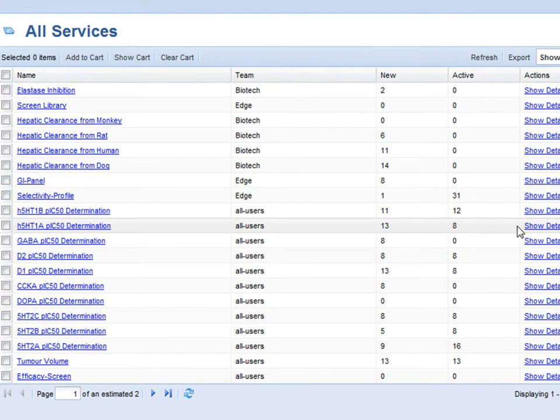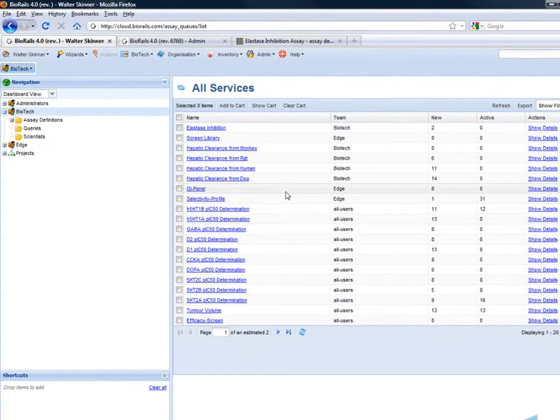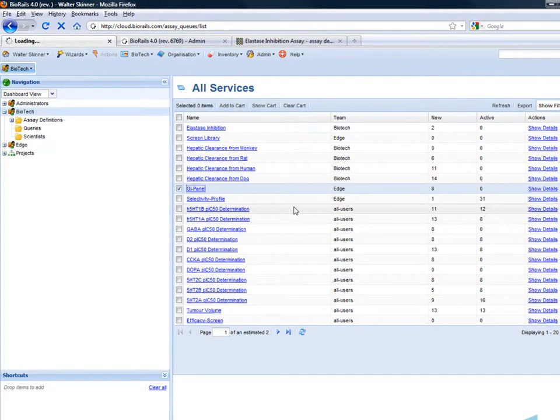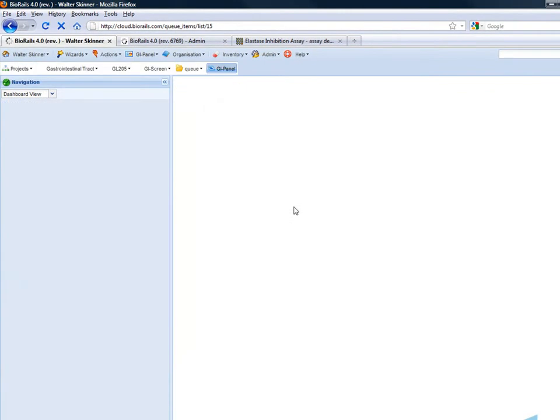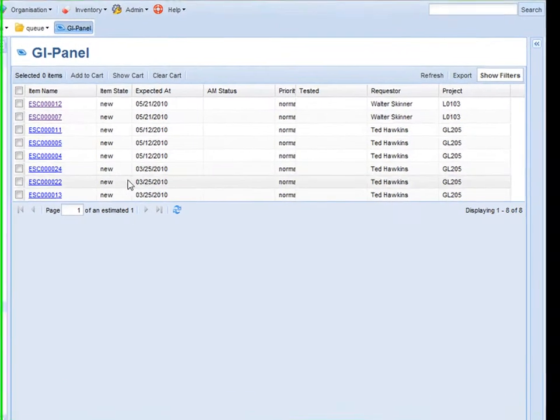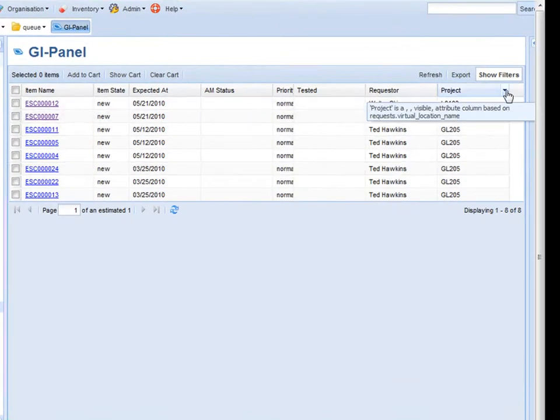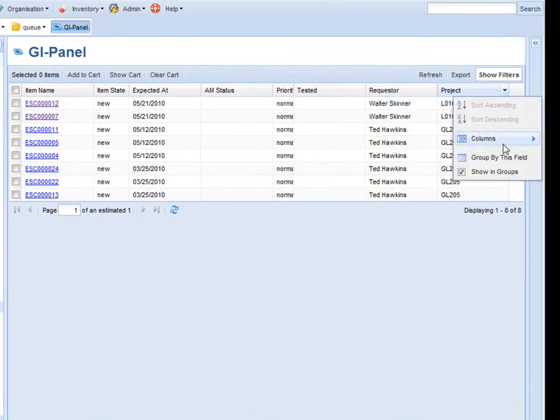In this case I am going to go and have a look at the GI panel service queue. This provides me with a list of all the incoming compounds. I can also group by project.